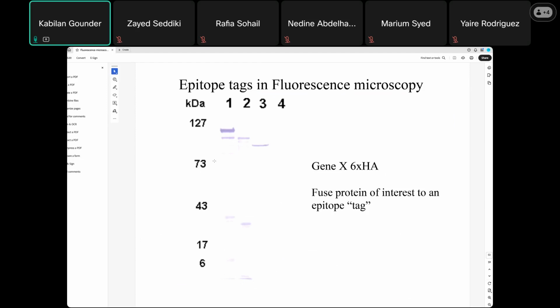You can see the tag antibody we used to detect the protein expression. You can see that the protein is expressed here. So this way, when you tag the protein, you are able to purify, characterize, and also study the functions of these proteins.